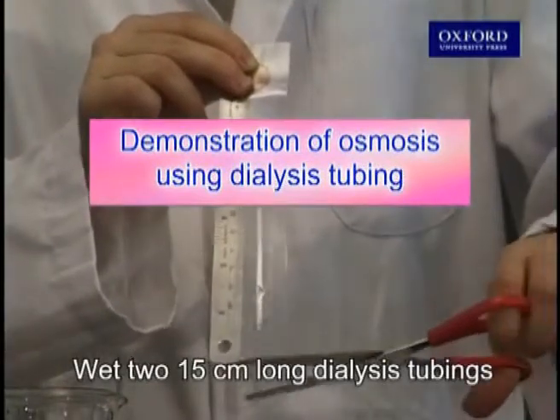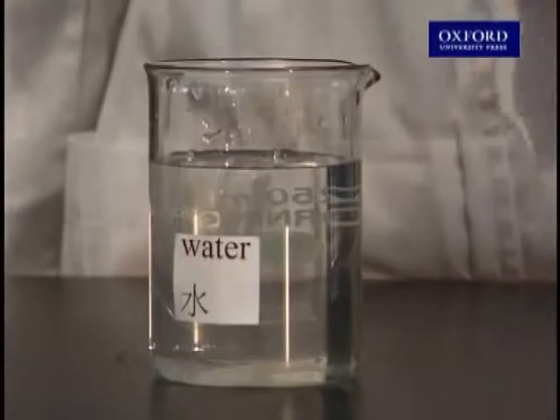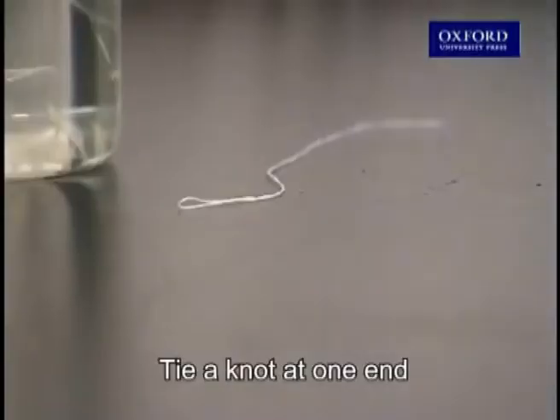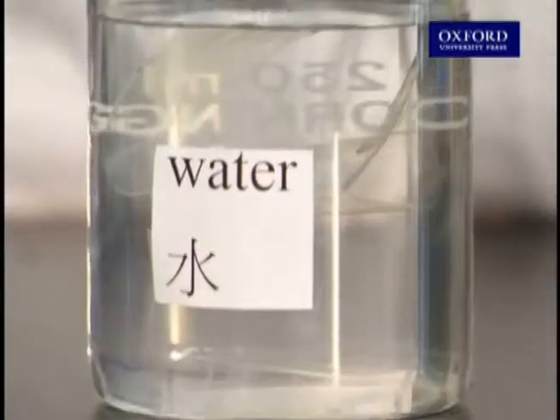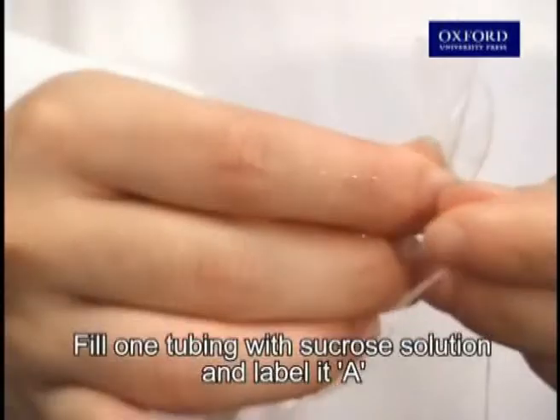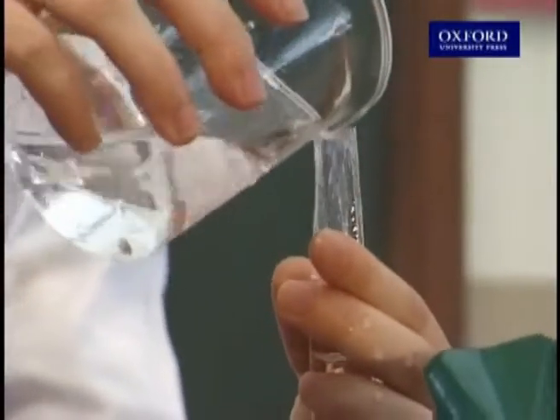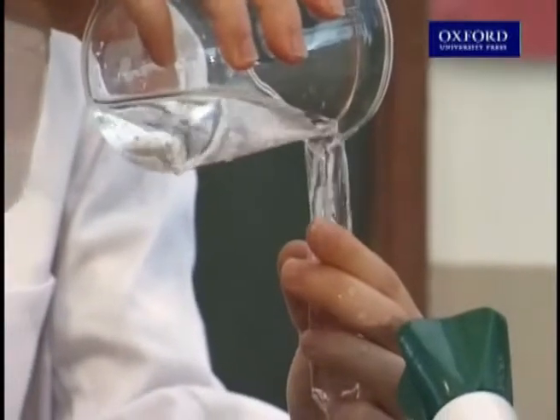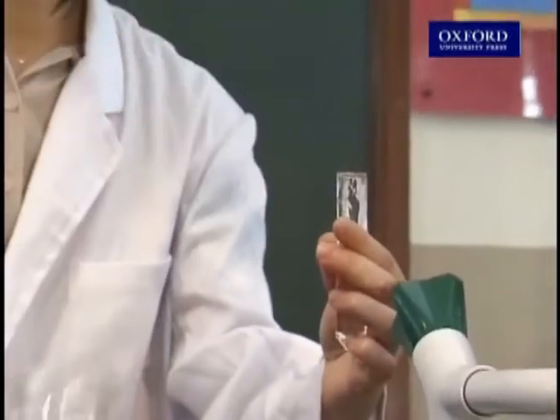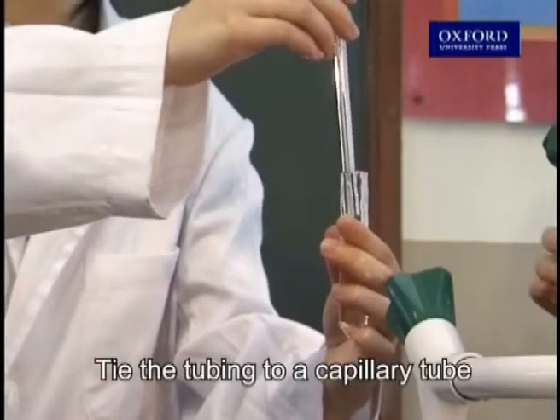Wet two 15 centimeter long dialysis tubings. Tie a knot at one end. Fill one tubing with sucrose solution and label it A. Tie the tubing to a capillary tube.